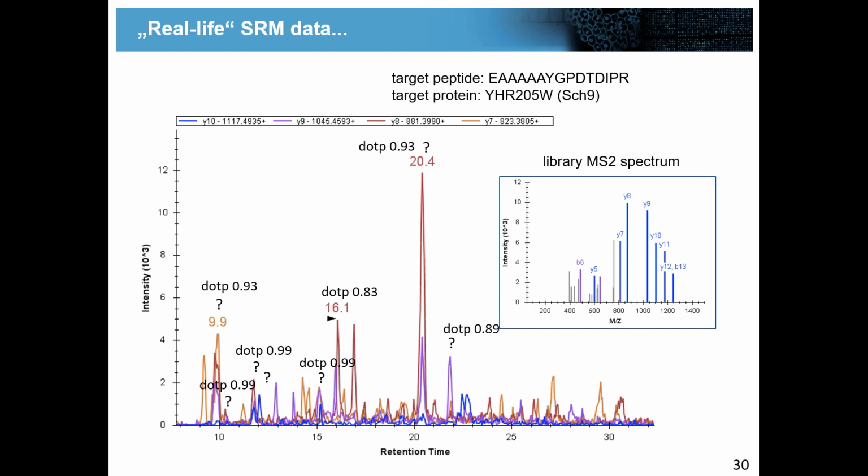What else can we do? Then you would need the retention time, right? Yes. So you could try to get the retention time information. Even though it might be, so yes, retention time information could help you to differentiate maybe this guy from that guy. But maybe still there are some close together. But retention time information would definitely be good. OK, we did it. It didn't help us. What else can we do?